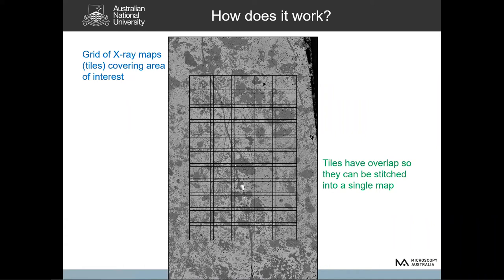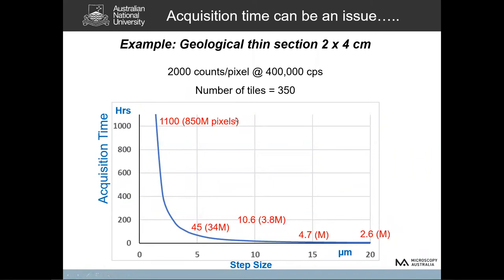And we can work with the whole map as one. Now, before I move on to how we then identify minerals, you have to appreciate that acquisition time can be an issue, because this graph is meant to represent what your resolution is, and that's determined by your step size as you step the beam across the sample.